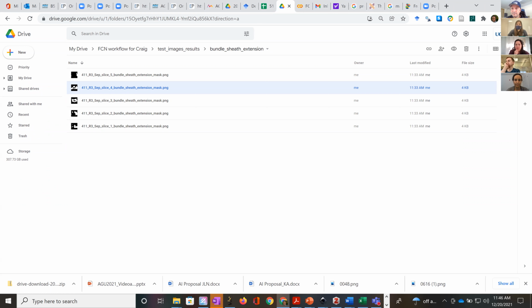Yeah, I wouldn't say that to make you work on it right away. That's definitely something that I think would be valuable. But whenever it makes sense for you, or maybe Mina, maybe you could weigh in on that too. I had another question, which was how many slices do you test and train on? What's kind of the minimum viable amount?